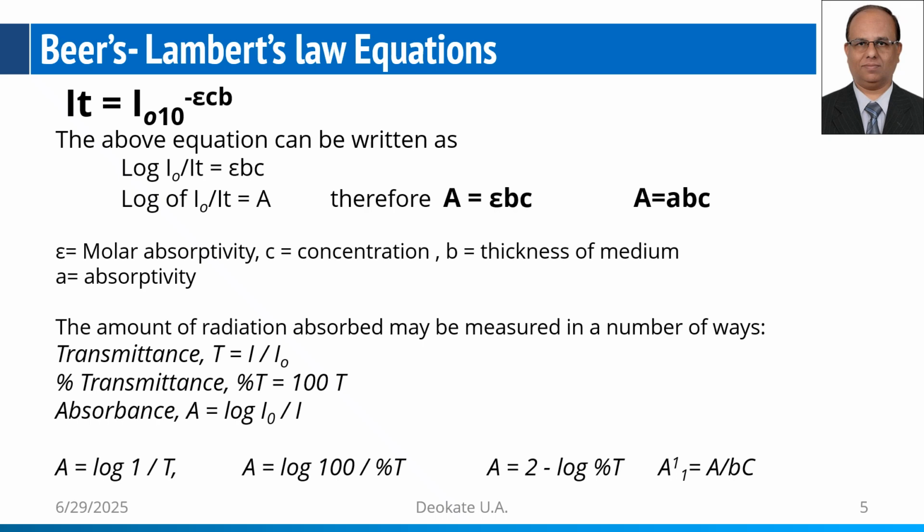Generally we use absorbance for all the quantitative estimations due to its linearity. Absorbance increases as the concentration increases. So this linearity is maintained if you take the absorbance on the y-axis.